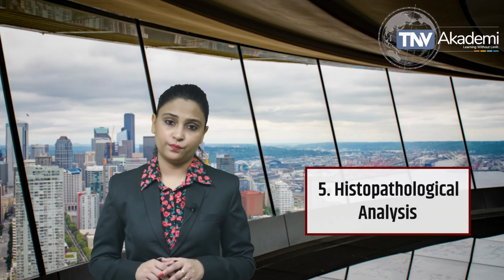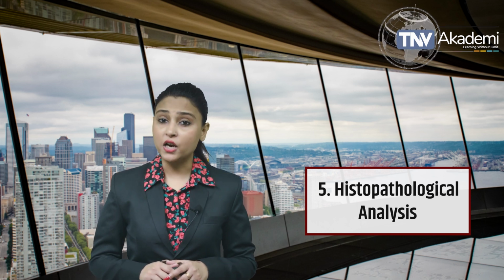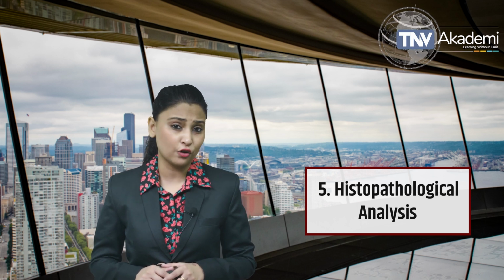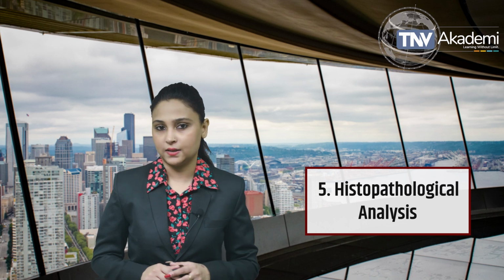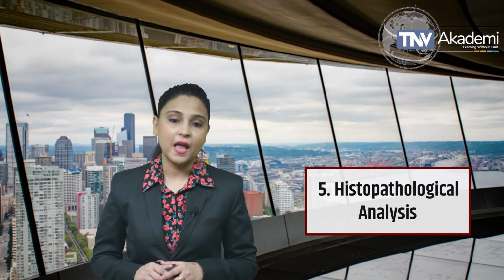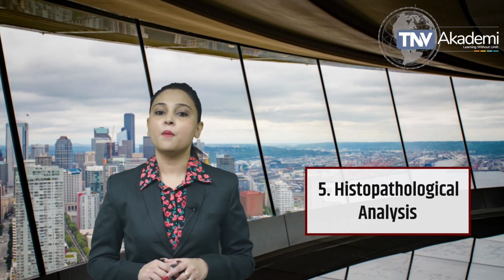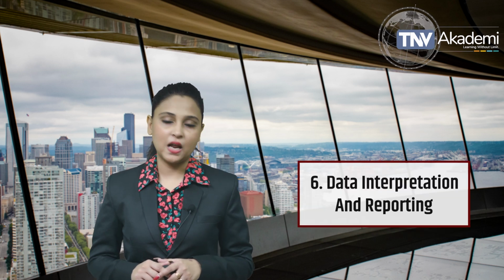Histopathological analysis. A histopathological analysis is conducted to examine the tissue structure and cellular reactions in detail. This involves examining thin slices of tissue under a microscope to evaluate cellular responses. It provides crucial insights into the tissue's response, helping identify any toxicity, immune reactions, or other adverse effects at a microscopic level.